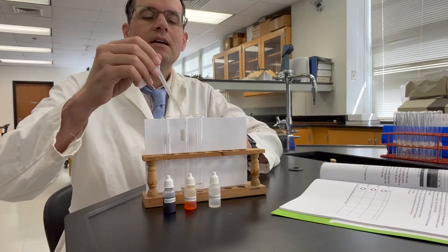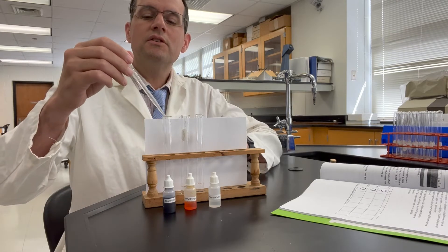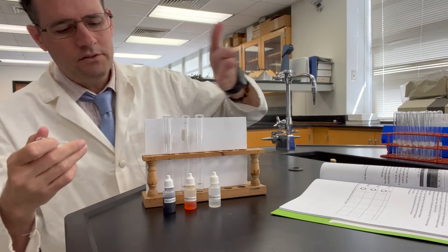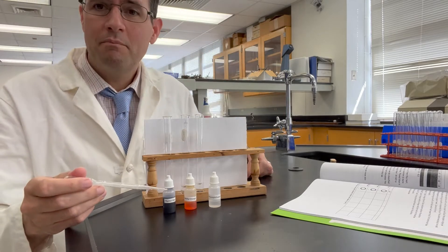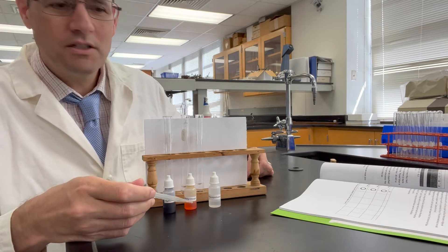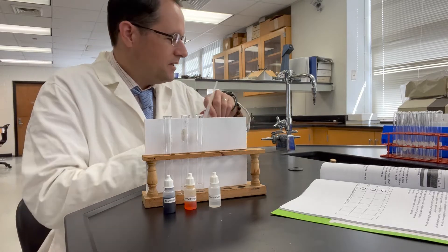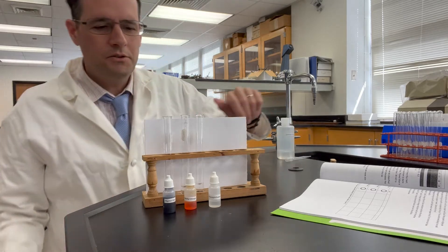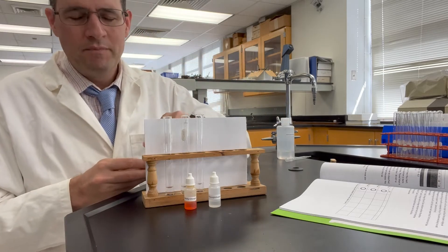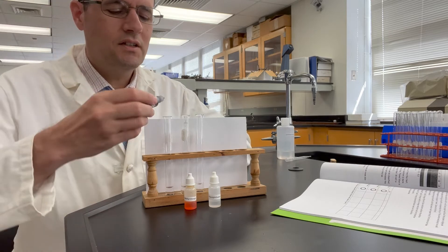I will be adding one drop of these indicator solutions in front of each of the test tubes. From your left to right we've got thymol blue, methyl orange in the middle, and phenolphthalein on the very right. Please refer to your indicator table to see what colors to observe. I've got a white paper here and I'll bring it up to the camera so you can see the colors clearly.